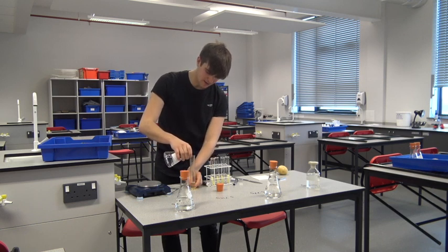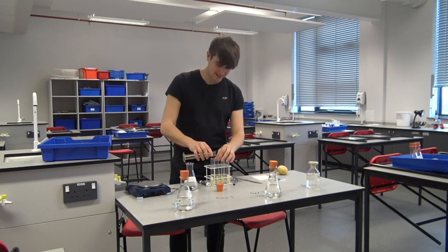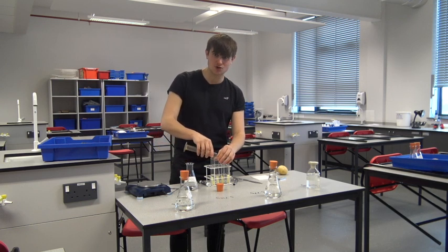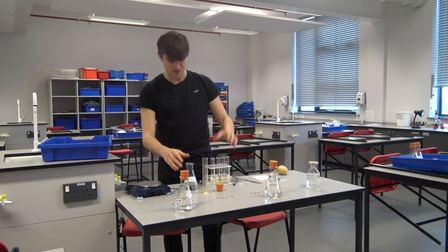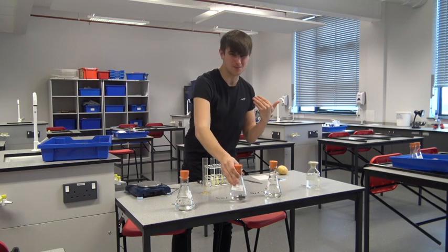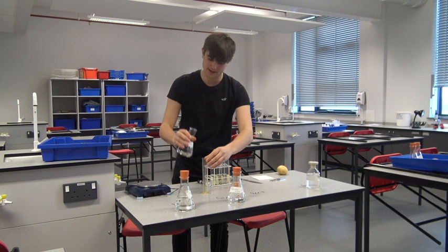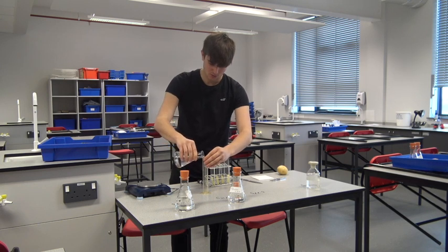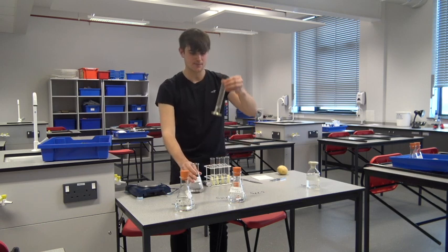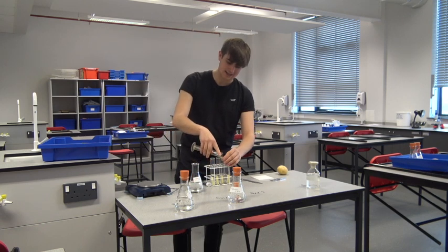What we should expect to see from this practical is that the most concentrated solutions cause the potato chips to become lighter. The next one I have is a 0.6 molar salt solution, followed by a 0.2 molar solution — 12 milliliters each. It's really important that we keep the same amount of solution added each time.